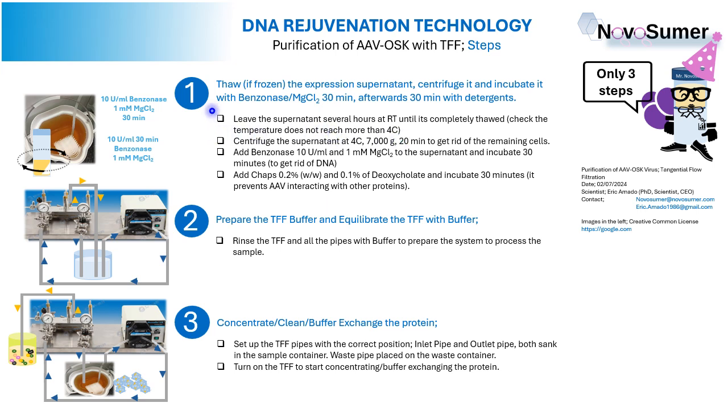The first step is, let's read with me, okay? Thaw the expression supernatant if it was frozen, centrifuge it and incubate it with benzonase and magnesium chloride for 30 minutes, and afterwards incubate it again with some detergents, okay? Let's understand this step.